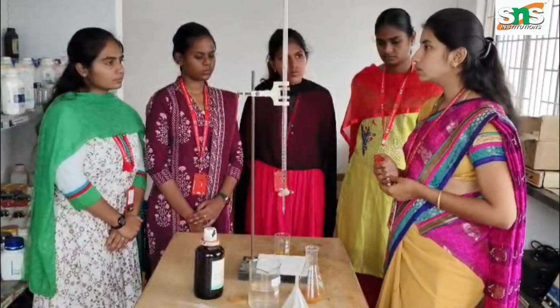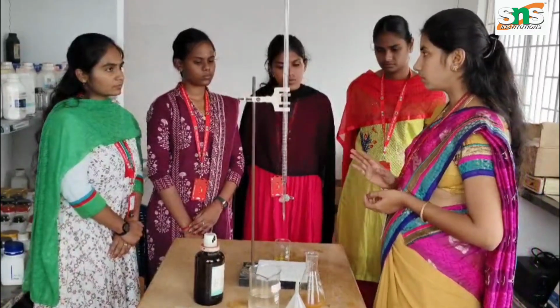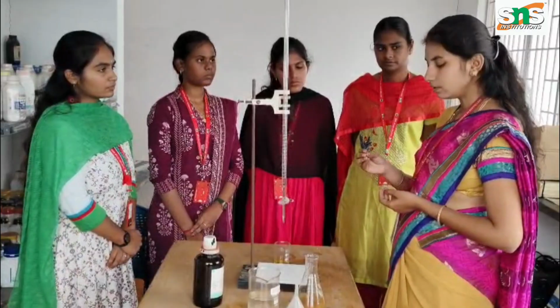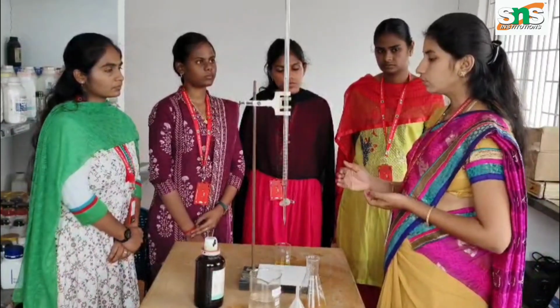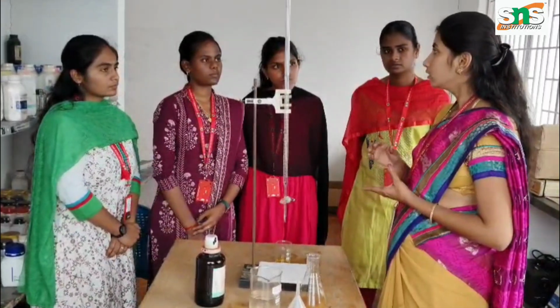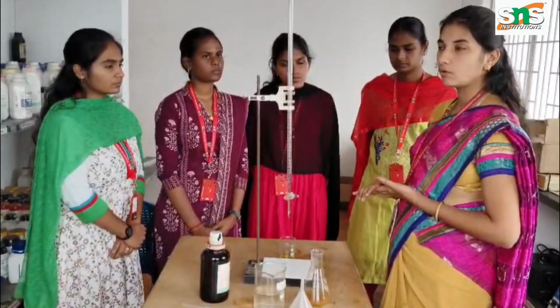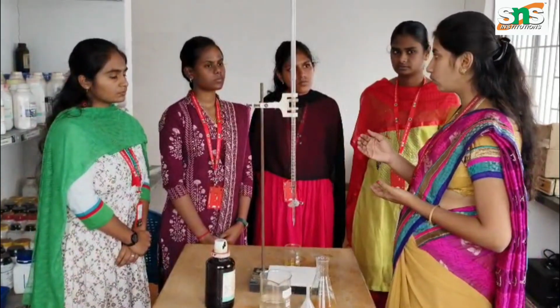and then repeat the titration, titration 2, with the same burette solution and the same pipette solution of 20 ml of the water sample and the additional solution of potassium chromate, and again titrate with the burette solution. We will get the same titre value with the reddish brown precipitate. So with these two values we apply the formula: the volume of the sample is 20 ml, and the burette value is 19.4.